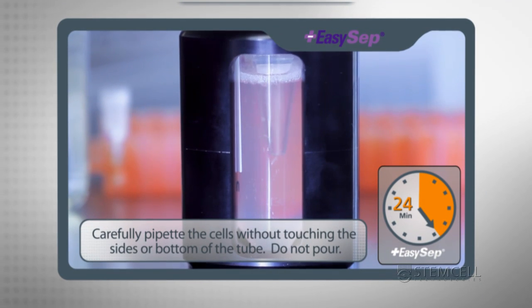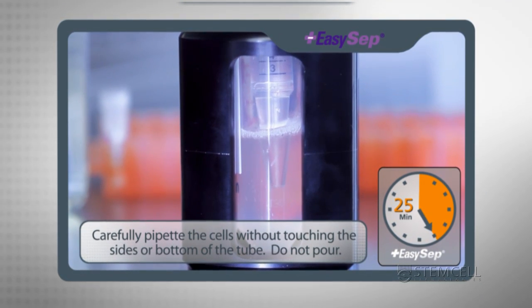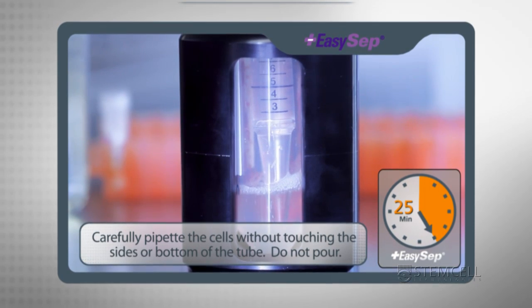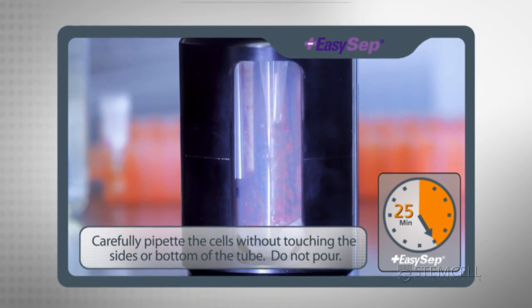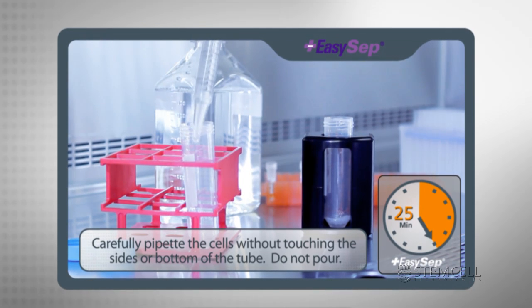Carefully pipette the desired untouched cells out of the magnet without touching the sides or bottom of the tube. Once these cells have been transferred to a new tube, they are ready for use in any downstream assay.